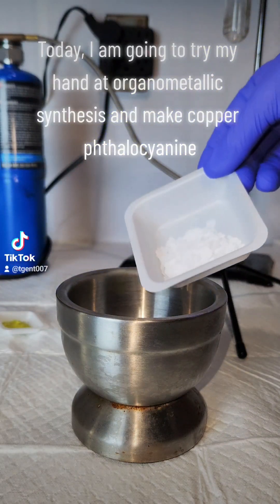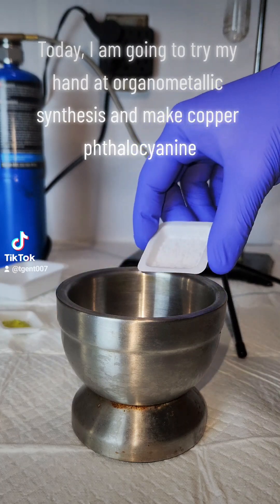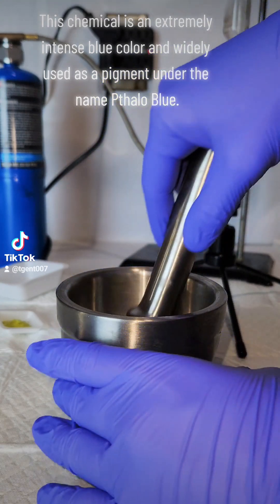Today I am going to try my hand at organometallic synthesis and make copper phthalocyanine. This chemical is an extremely intense blue color and widely used as a pigment under the name Phthalo Blue.